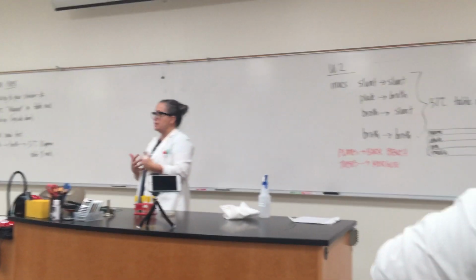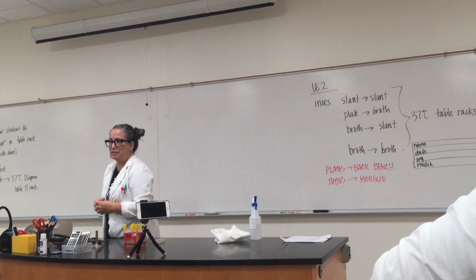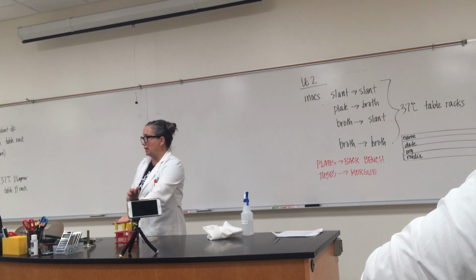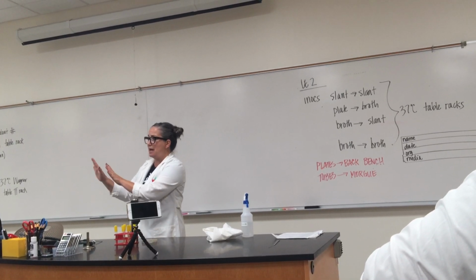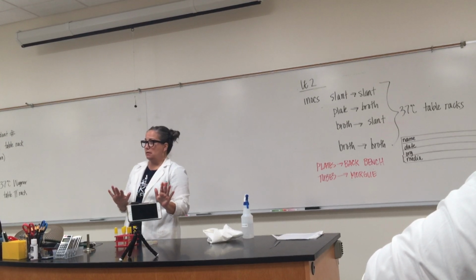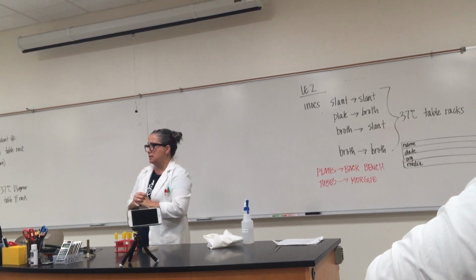So when you're finished, you're free to go. You don't have to wait for everybody else to get done. If you get done before your lab mates, please do not discard the organisms, right? The person who is last on your team, just give them the organism. Don't assume they're done. If you're done, just leave them in someone else's test tube rack.